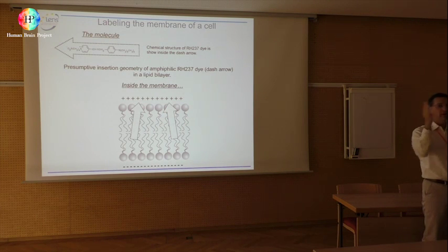So second harmonic here it's 5, second harmonic here it's 10. Okay, so the amount of second harmonic here depends on the electrical field across the membrane. Is it more clear? Okay?